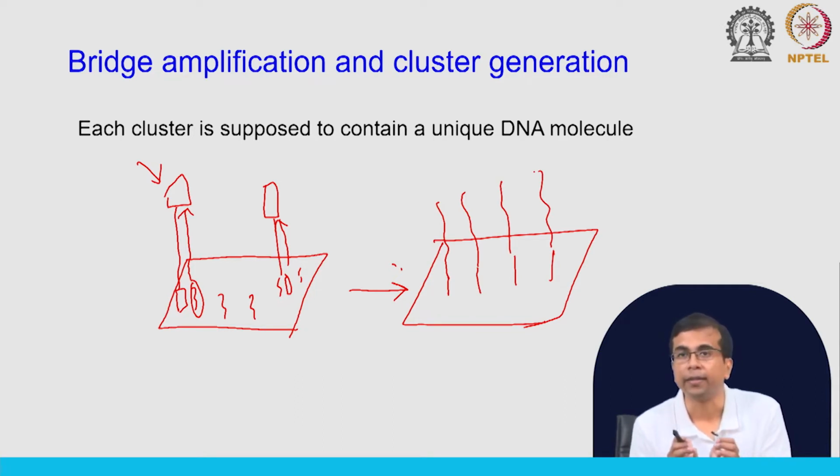Again, you need to calibrate the number of DNA molecules that you allow to hybridize on this plate, because in the next step there is bridge amplification. What is the idea behind this bridge amplification? You have seen emulsion PCR, which is a clonal amplification, where a single molecule generates multiple copies inside these emulsions. Why do you generate so many copies? Because for the signal detection, we need a lot more signal. The detectors in 454 or in Illumina cannot directly identify the signal from a single molecule.